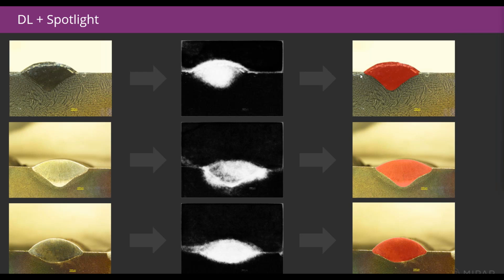We can add in things like separating it at the substrate surface such that we can get a depth profile above and below the surface. We can measure various depths across the horizontal and get ourselves a variation in depths as well as an average. There's all sorts of things we can do integrated right into the same recipe once we have accurate feature awareness of the bead as well as its background and substrate.